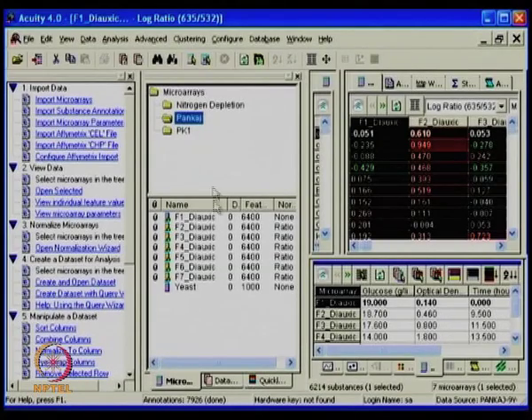In this fashion, I have defined in the microarrays the folder about the training, and it shows what different slides are available to us. Here we see 7 different time points collected, and these are individual slides which one has run with both Cy3 and Cy5. So this is a ratio based image which we are going to see, and we have also got another file which comes from text, to show you that even that can be imported.